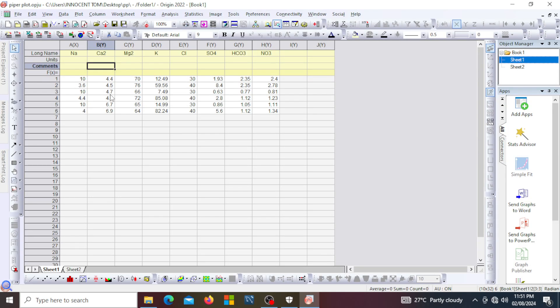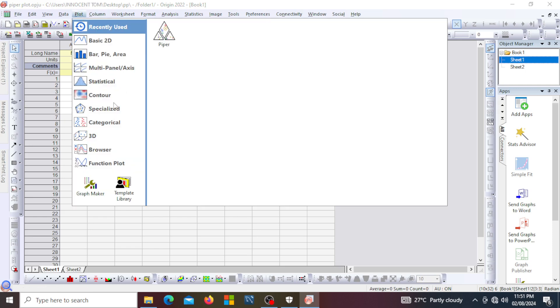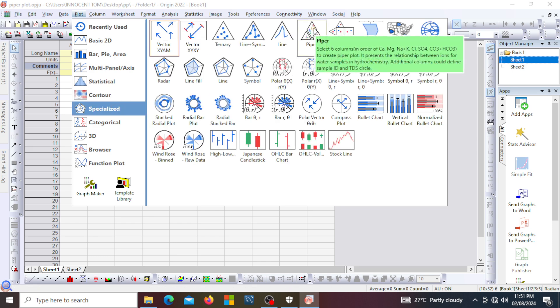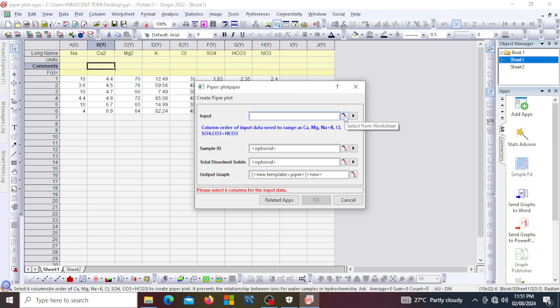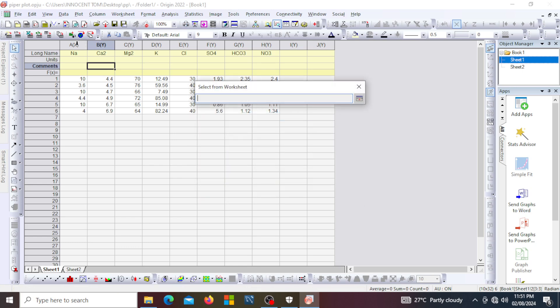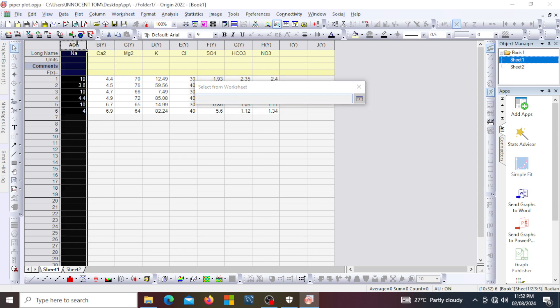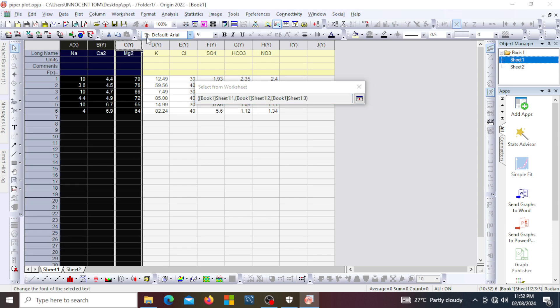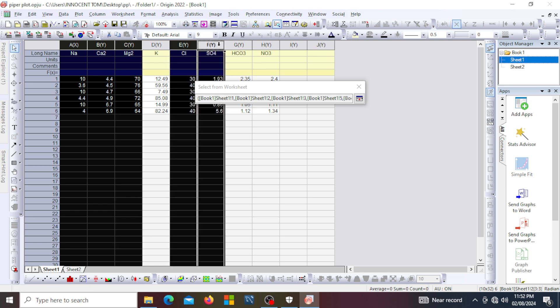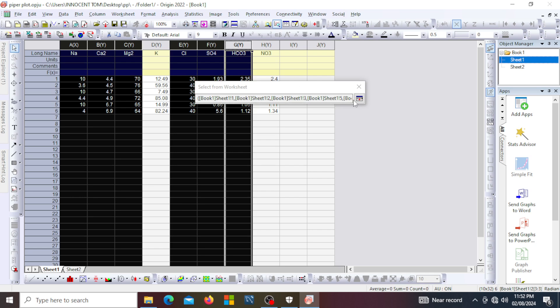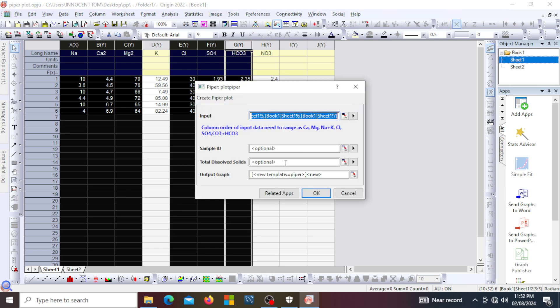Good evening and welcome to today's lecture. I want to teach you how to plot the Piper diagram. To plot the Piper diagram, go to Plot, come to Specialized, select the Piper Plot, then select your cations and anions that you want to plot — six of them.